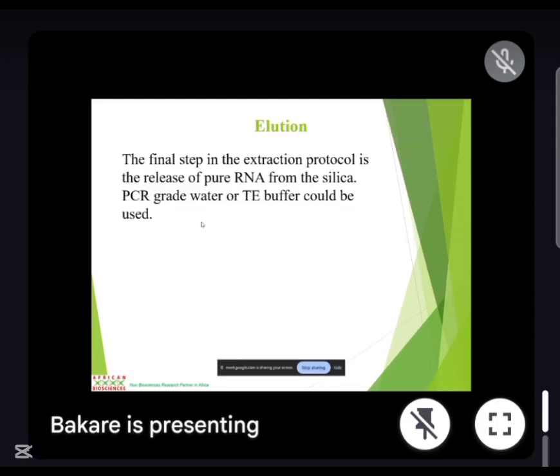We know that RNA is single strand and DNA is double strand. So immediately you extract your RNA, you take it to -20 or 4 degrees Celsius or -80. Even DNA, you can still put DNA in the freezer, in the fridge. But RNA, if you put your RNA in the fridge and not the freezer, you cannot use it for more than 1 hour.